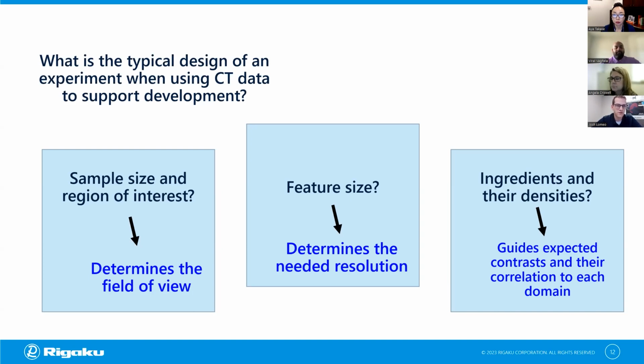Yeah, so typically, if we're talking about a tablet as an example, the best field of view is ultimately the full tablet. As we do that scan, it allows us to see if we're getting some sense of features that we may see better with higher resolution. That'll help us pinpoint where within the tablet we need to make that scan.